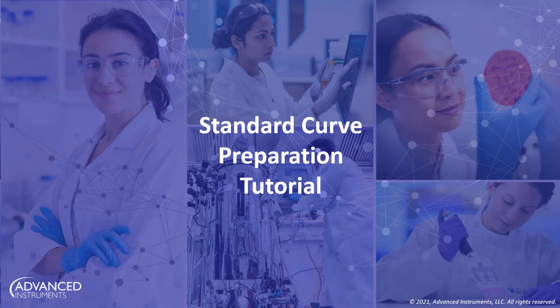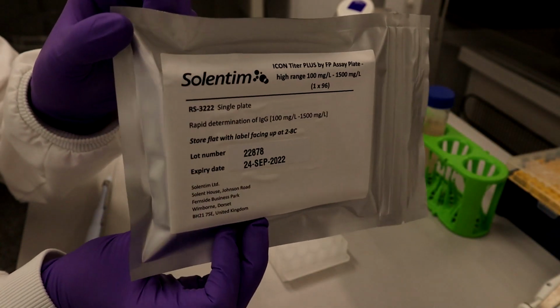Hello, I'm Emma and I'm going to be talking you through how to set up a standard curve ready for clone productivity assessment using the iCON. Before you begin your standard curve preparation, make sure that all of your consumables required have had sufficient time to warm to room temperature.